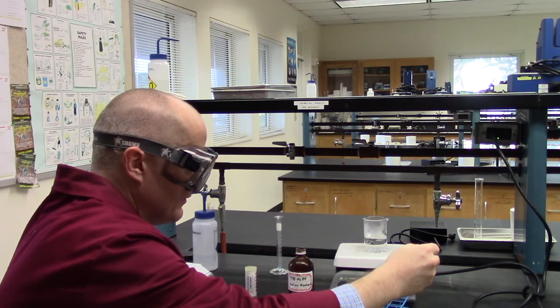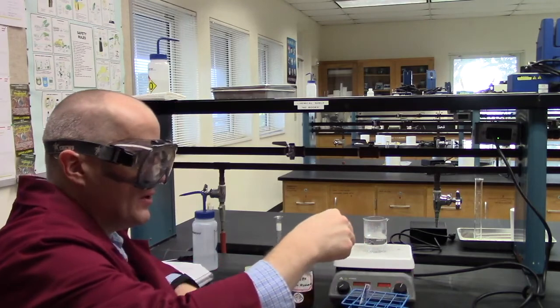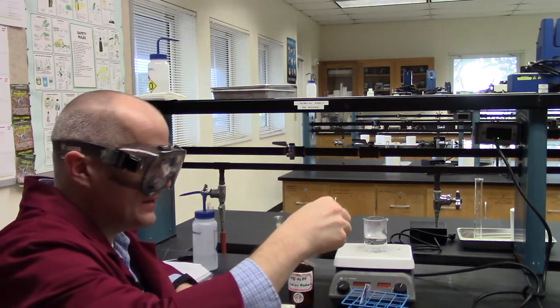1, 2, 3, 4, 5. How about 5 drops? Probably going to regret not just adding a milliliter, right? Always follow the instructions, as they say.